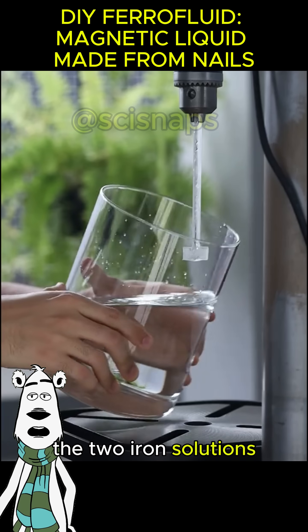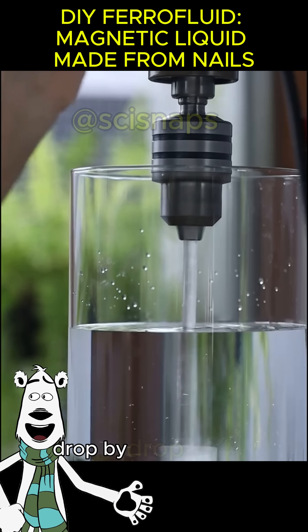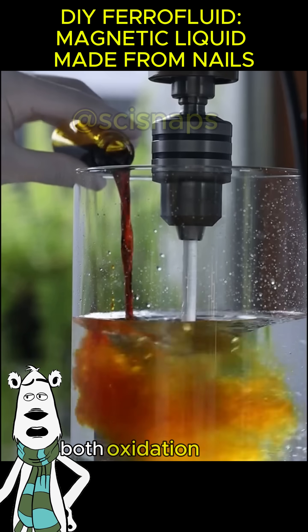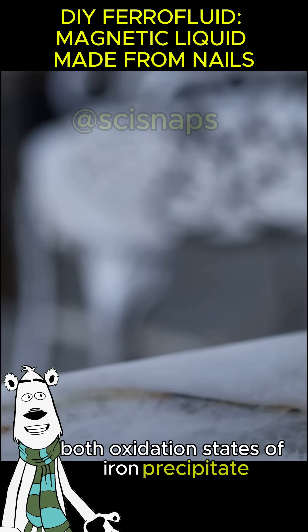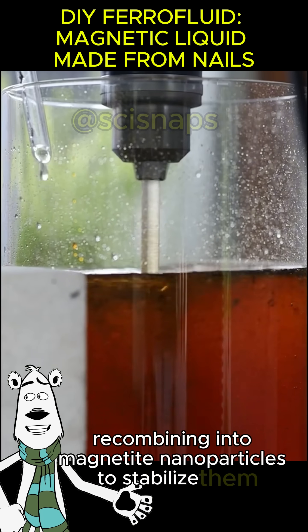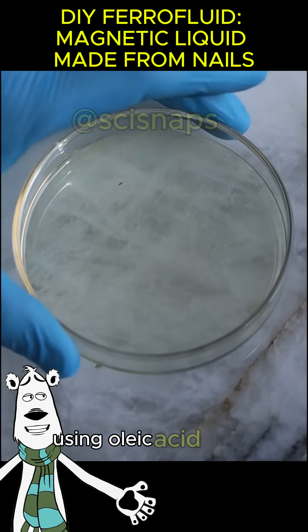The two iron solutions are added, followed by ammonium hydroxide drop by drop until the pH reaches ten. Both oxidation states of iron precipitate, recombining into magnetite nanoparticles. To stabilize them, ammonium soap is made on a petri dish using oleic acid from olive oil and ammonium hydroxide.